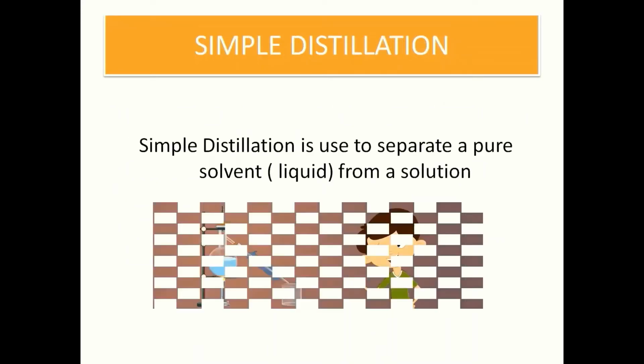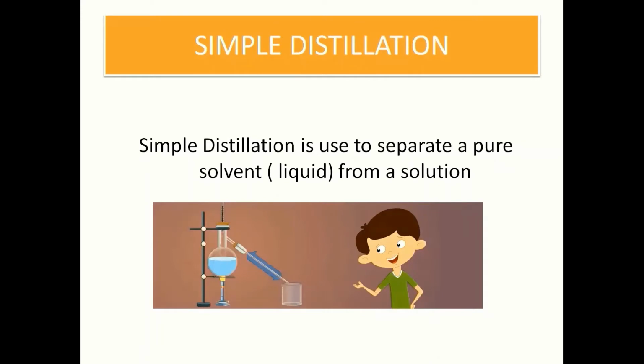Simple distillation can be defined as follows: simple distillation is used to separate a pure substance from a solution. An experiment cannot be understood without visualization. So let's have a look at how this experiment works.